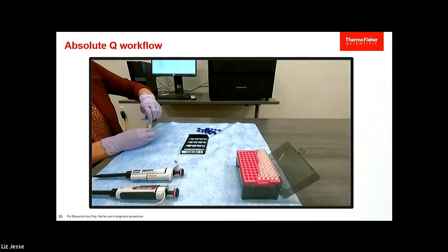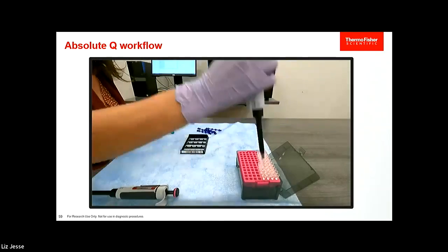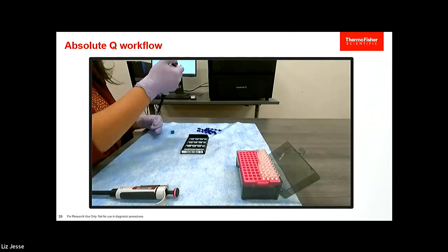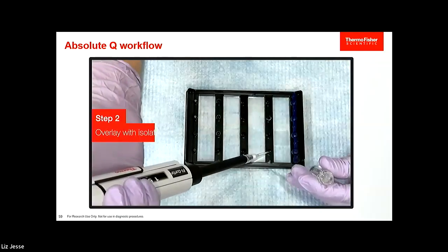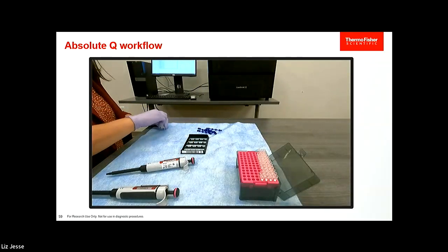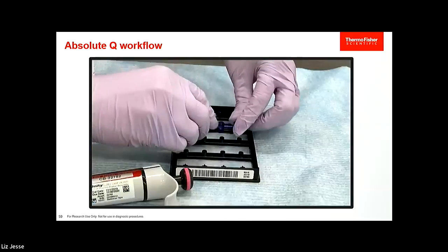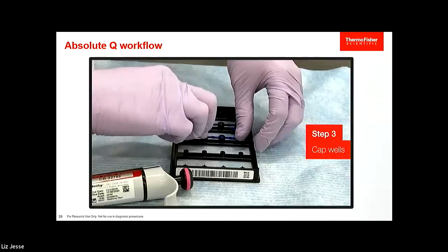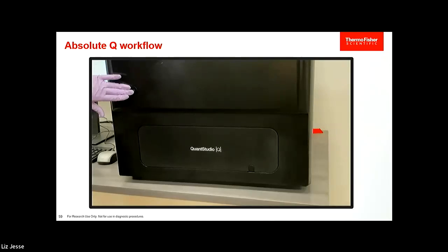We then utilize an isolation buffer to act as a liquid cap on top of your sample to avoid evaporation issues, if anybody remembers old school PCR. That isolation buffer is actually a different density, so it sits on top of the sample. And when you apply the air pressure, it will literally follow your sample down into the wells and seal them off from each other.